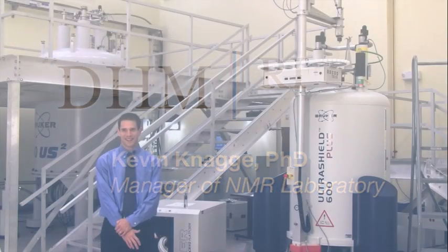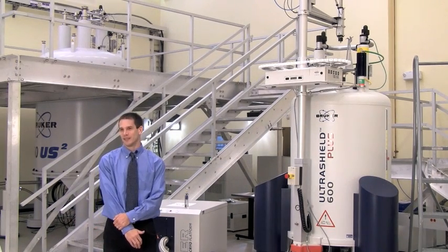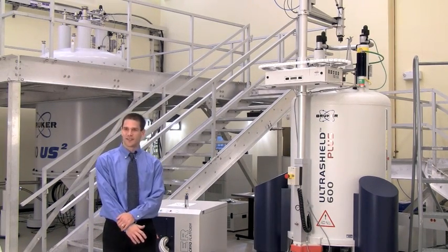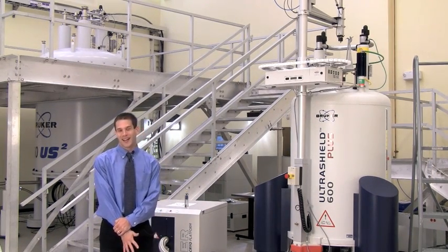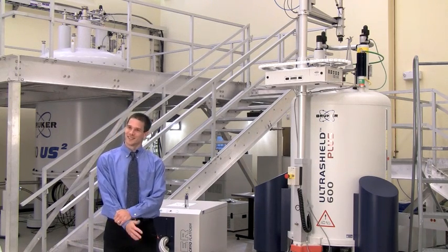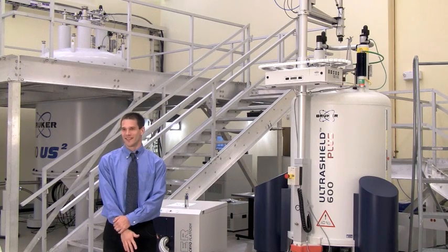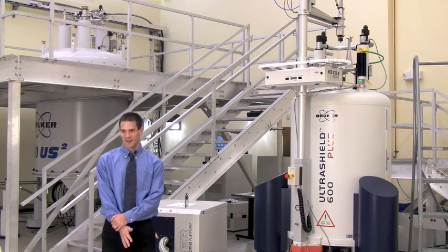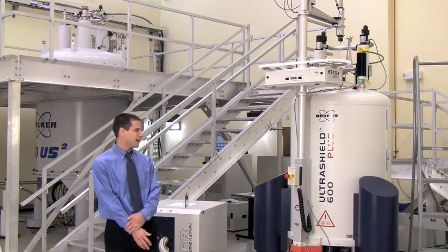We are in the NMR lab at the North Carolina Research Campus, and here we have a few different NMR instruments. NMR stands for nuclear magnetic resonance, which is similar to MRIs. MRI is just magnetic resonance imaging. So we have here a few instruments that are very similar to MRIs.